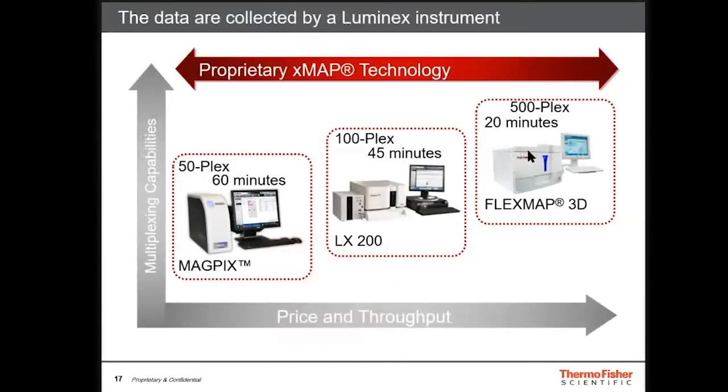And then we have, say, a secondary antibody that has a fluorescent marker that the instrument can also use for quantitation. The Luminex instrument actually, there are 3 different types now. The one in the middle is their oldest one. It's been around forever, very common in labs. The Model 200. The FlexMap 3D further over is a little more expensive. It has 3 lasers instead of 2, can do a higher plex. The original instrument could do 100 plex, the FlexMap 3D 400 to 500 plex. And then they have a less expensive instrument that's CCD camera based that can do up to 50 plex.